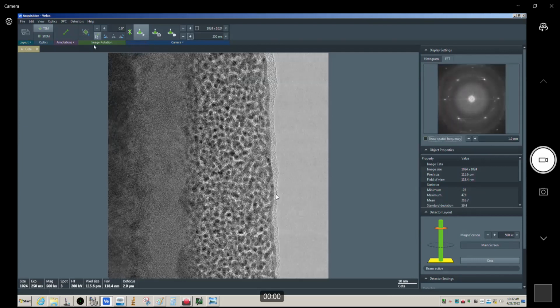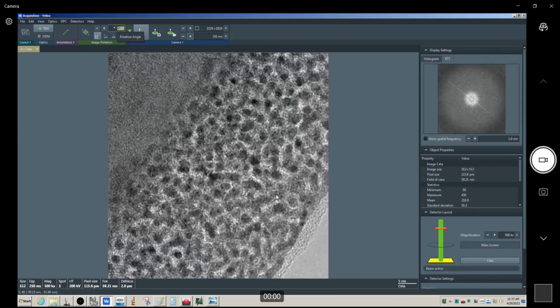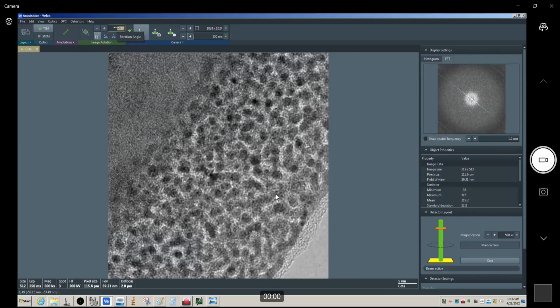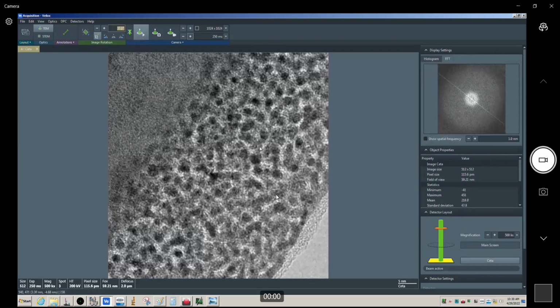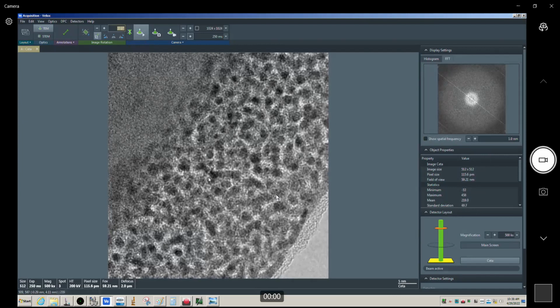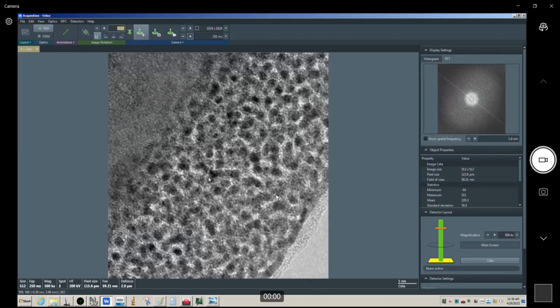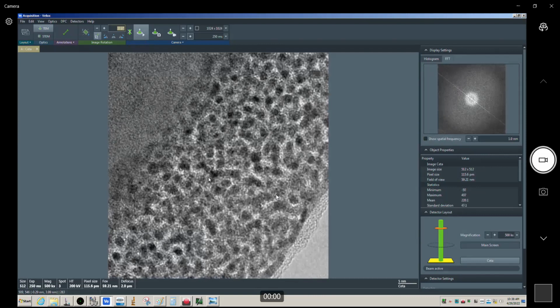But let's say I don't want to go in a nice increment of 90 degrees. Let's say I want to do 37 degrees. What's going to happen? You can see that my viewable area got cropped. The viewable area is now half as wide as it was.